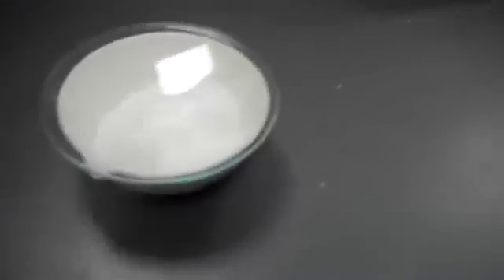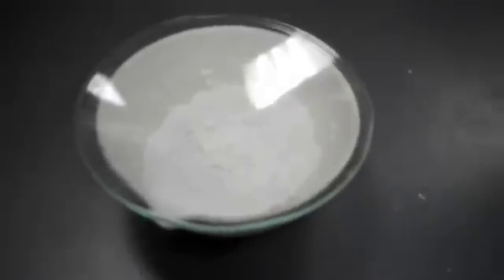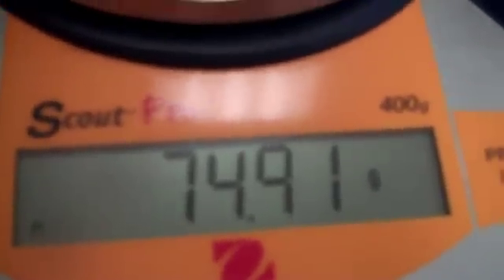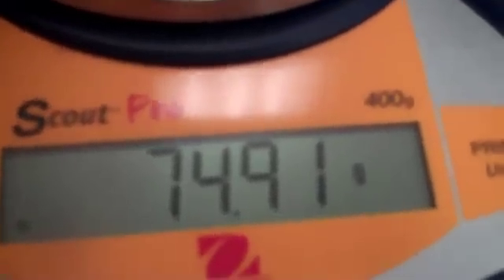After your evaporating dish is cooled, you're going to want to find the combined mass of the watch glass, the substance within the evaporating dish, and the evaporating dish itself. It came out to be 74.91 grams.